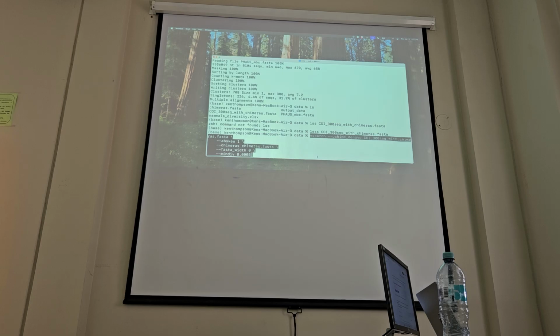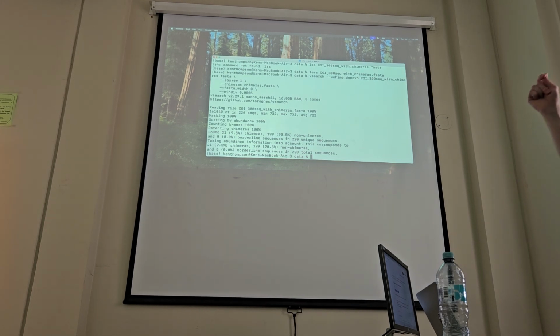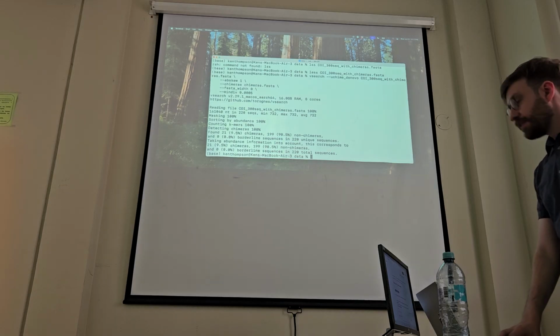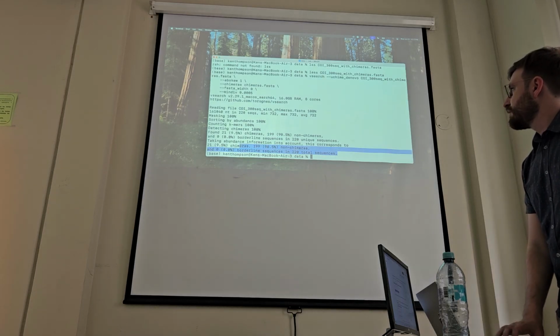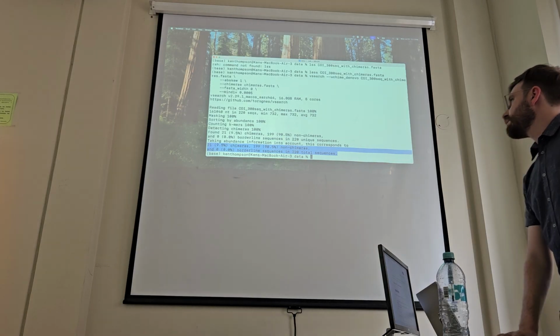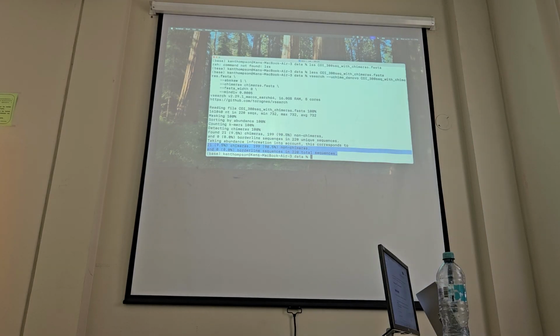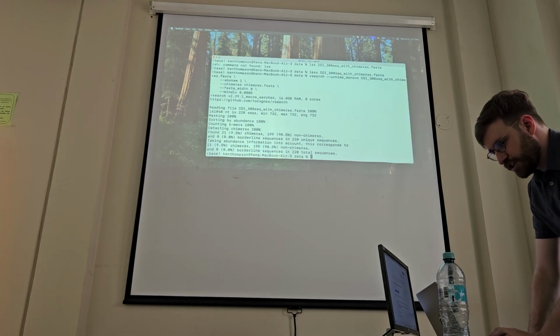But this is to check all those trios of the parents and the query files. Check, check, check, check, check, see what's going on. So you can just run this. Runs, very simple, just like before. And it tells you here 21 chimeras and then 199 non-chimeras, right? So that's how we did all those little pairwise triads.